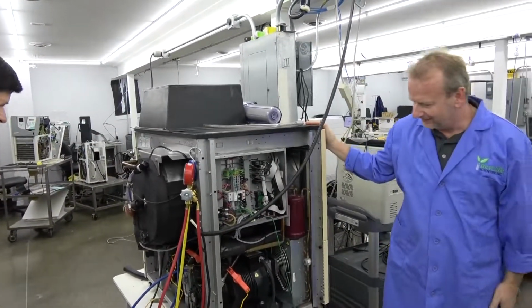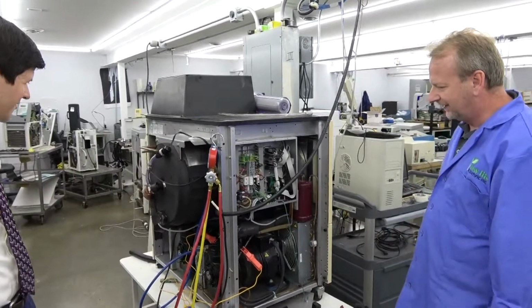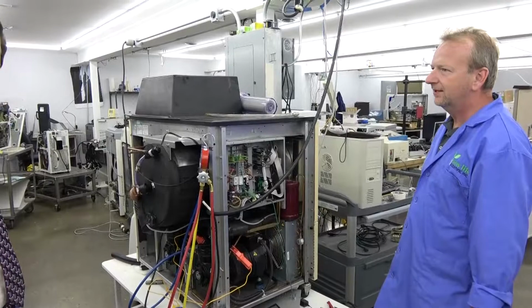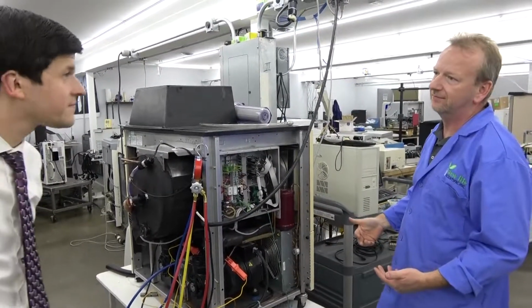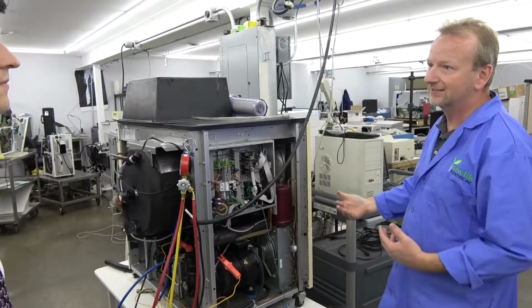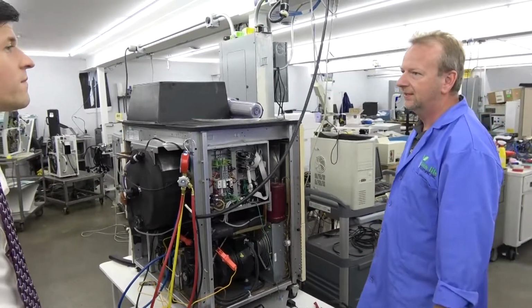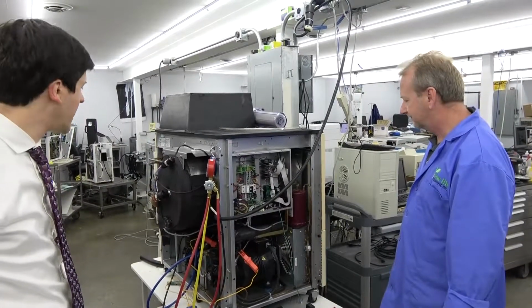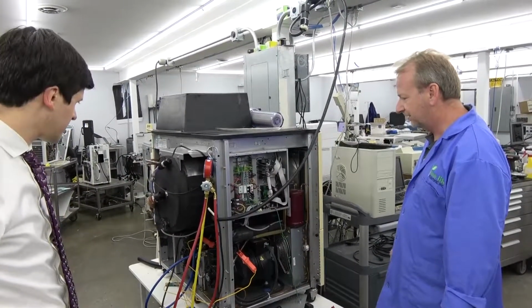Negative 105, and still dropping. Great. Ambient temperature in here is about 73. Without getting the ambient temperature down to about 70 degrees, that's what we even needed to get to the factory spec, because based on your ambient temperatures here, it's working harder. Anyways, it's pretty much buttoned up.